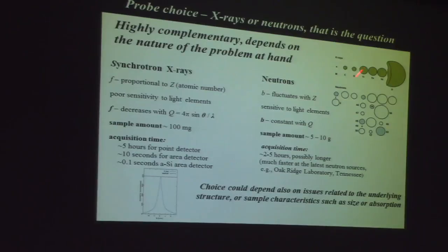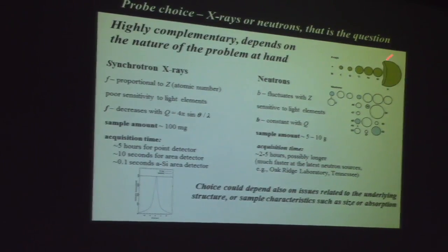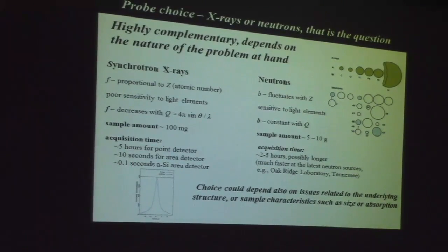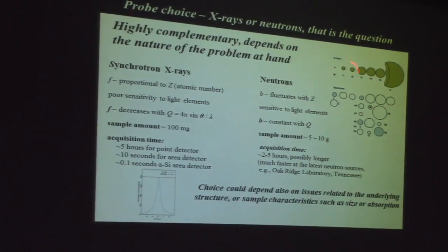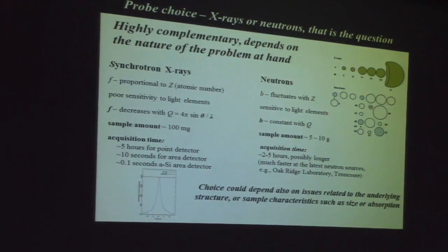But the oxygen is very weakly scattering, and it's surrounded by some very heavy scattering atom like barium. You can't just measure for a longer time to get a stronger signal on the oxygen. You can do that, but your scattering pattern is still dominated by this heavy scattering element.